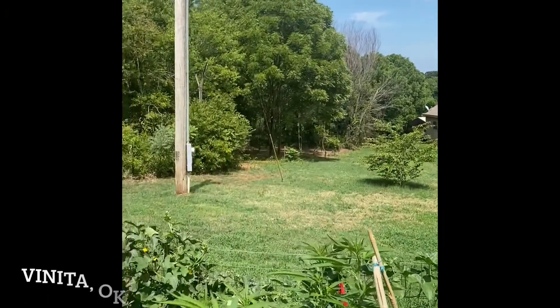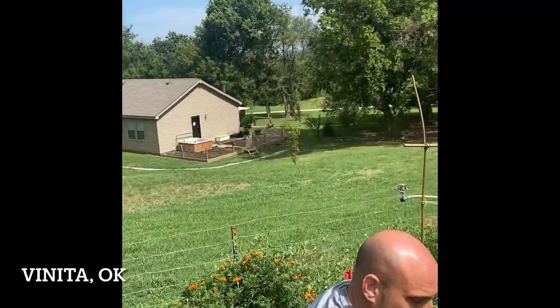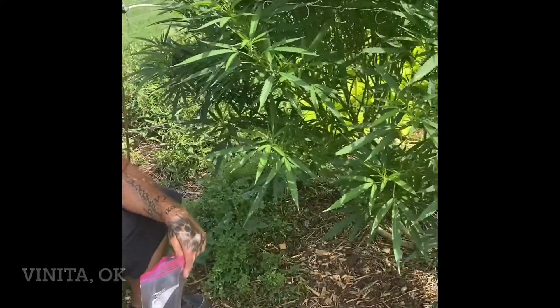We're here at Gnarly Roots Cannabis, taking a soil sample for the microbiometer.